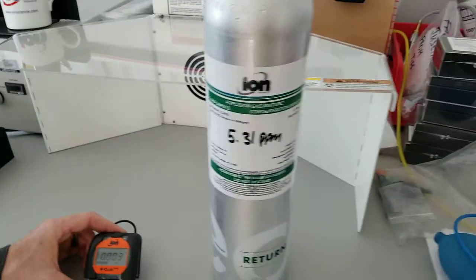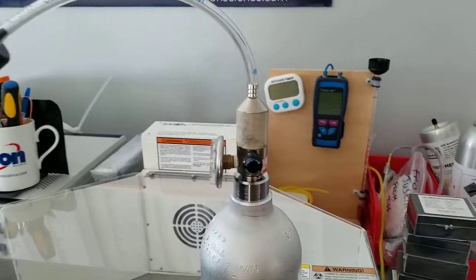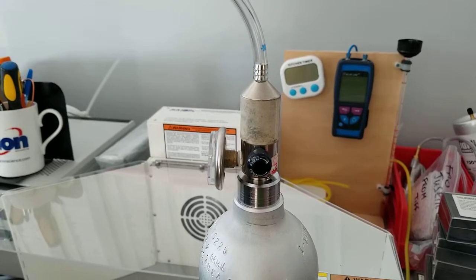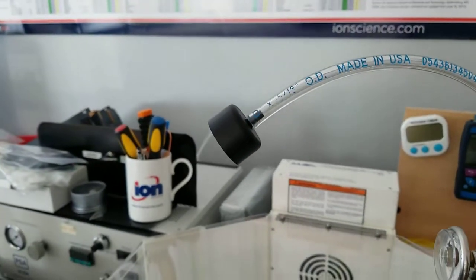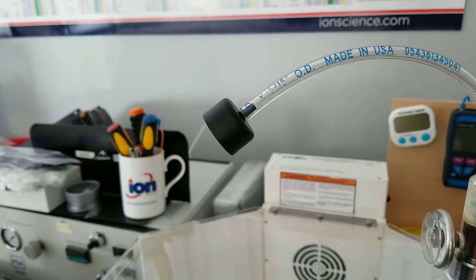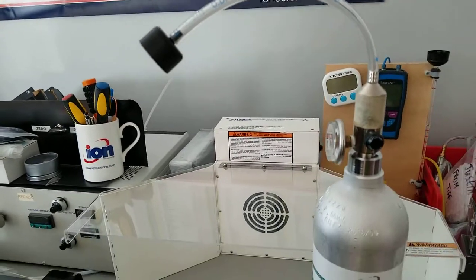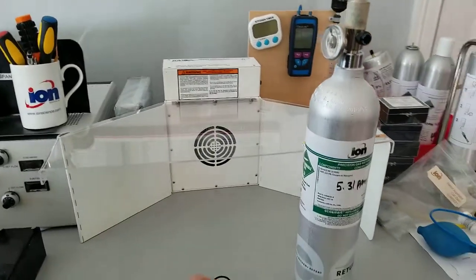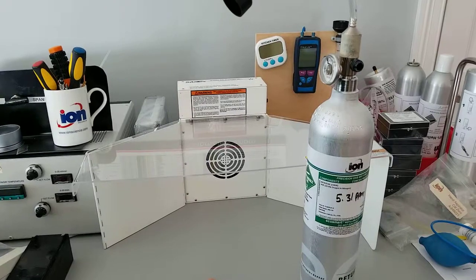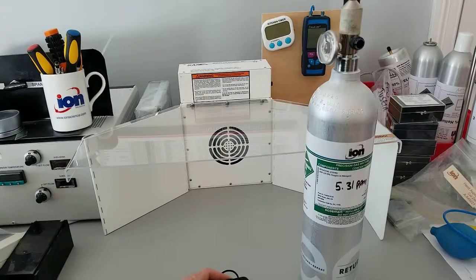We will also need a cylinder of 5 ppm benzene, and we'll need a regulator set at around 0.5 litres per minute, attached to a Cal Cup. The Cal Cup is supplied brand new with every Cub instrument, so you should have one. For safety, there's a benchtop air movement cleaning device in the background — you'll want that when working with benzene gas.